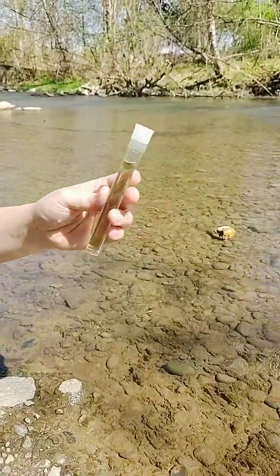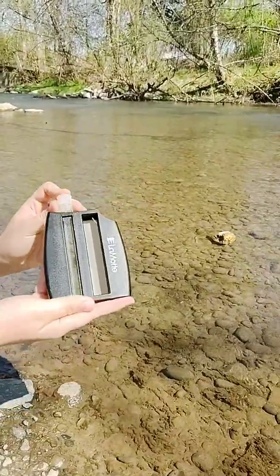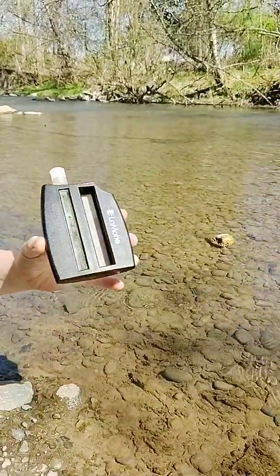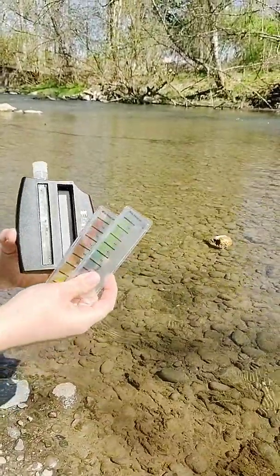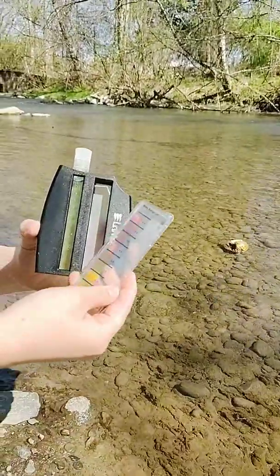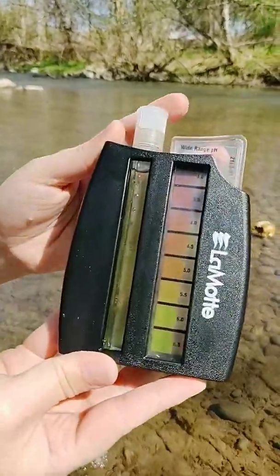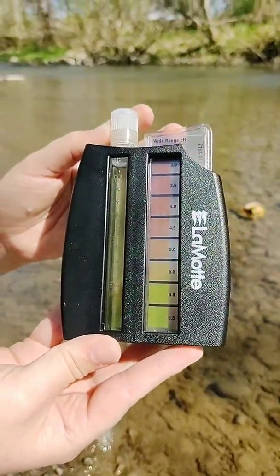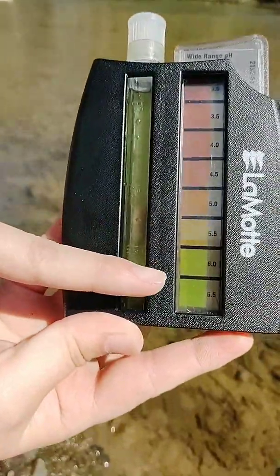Now we're going to use our viewer here, and we'll put the tube right there. Those slides I showed you earlier, we're going to put both in and match the colors. First I'm going to start with the 3.0 to 6.5 slide and put it right in there. Basically what we're doing is matching the color of the test tube and seeing which color it best matches on the slide.